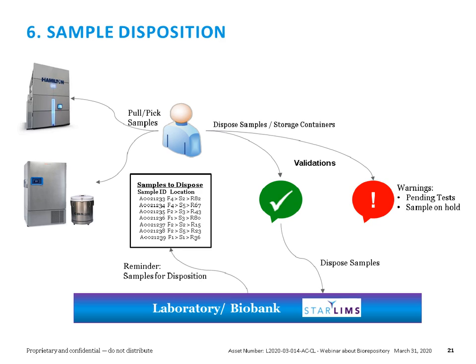It should only update the status of your sample, meaning that after the sample has been disposed, you know who disposed it, when it was disposed, and the reason why it was disposed. You should have all that information, and the history of the sample will remain in the LIMS. Everything that happened from the moment it was collected, arrived at the lab, and everything that sample had to go through, the whole chain of custody.